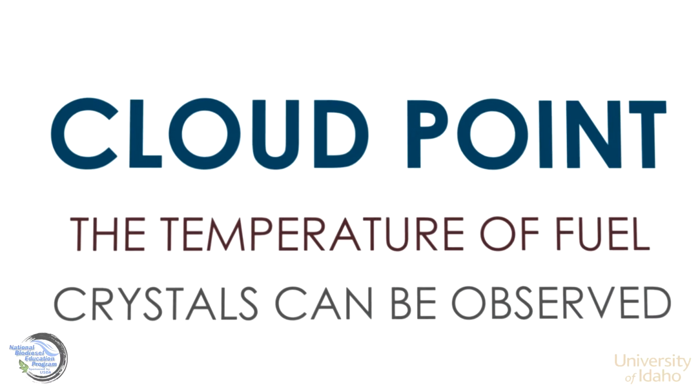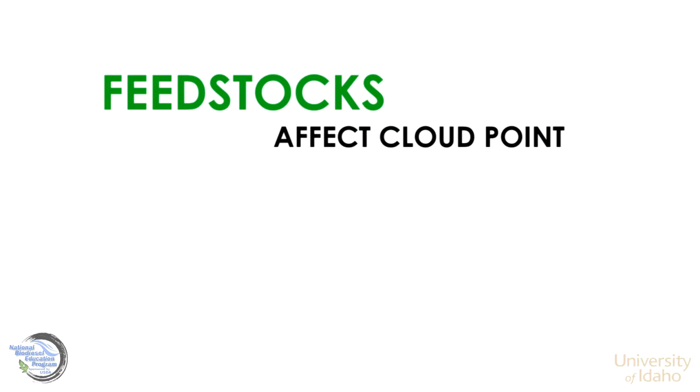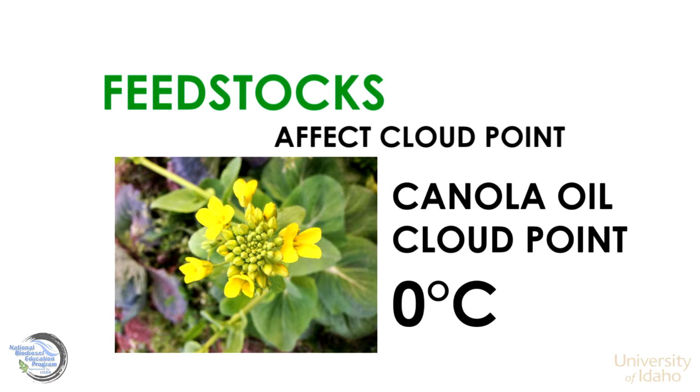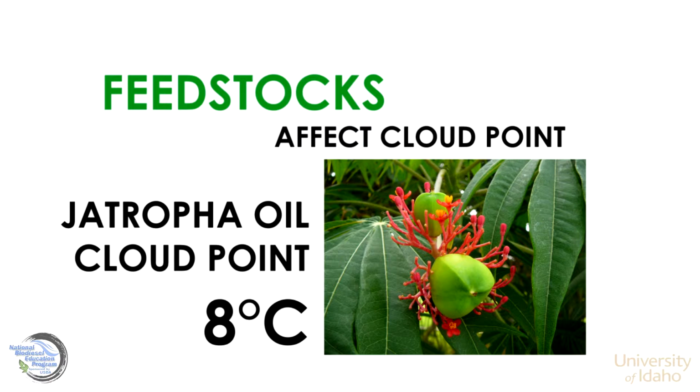The cloud point is the temperature of the fuel at which small, solid crystals can be observed as the fuel cools. Feedstocks used to produce the biodiesel affect the cloud point temperature. Soybean oil feedstock produces a biodiesel that has a cloud point around 1 degree Celsius. Visible crystals show up in biodiesel made from canola oil around 0 degrees Celsius. Biodiesel made from jatropha oil begins to crystallize around 8 degrees Celsius.